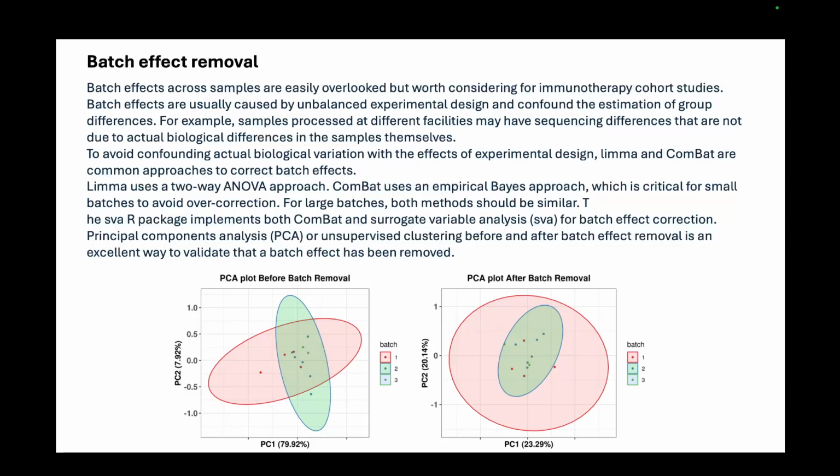As I was saying, instead of imagining the set of samples in space, what we do is principal component analysis. Your data is multi-dimensional and a very big data set, with thousands of features. You want to represent these 1,000 features with two features that can explain a certain amount of the variance of the 1,000 features. So principal component one versus principal component two. Principal component one explains almost 80% of the variance, and principal component two explains a further portion of it.